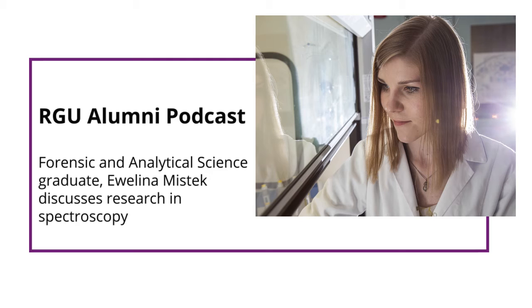And so is this all done in the lab, or can this be analyzed on site? That's actually the ultimate goal. I believe for now mostly everything is done in the lab, but there are already portable or even handheld instruments, devices as big as your cell phone, that can be brought to the crime scene. And that is a great advantage because the actual analysis is really quick. It's a matter of seconds to obtain the spectrum.